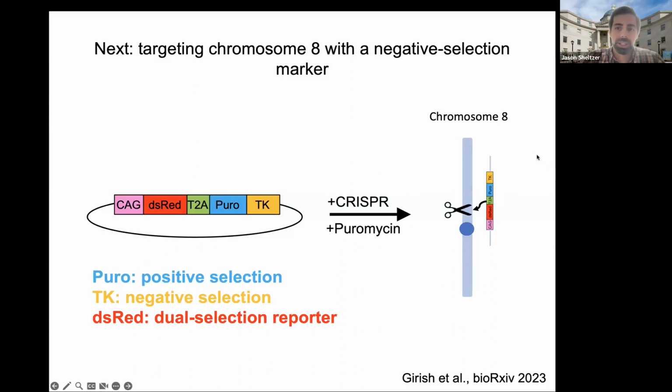However, if we're targeting, for instance, trisomy of chromosome 8, following the ganciclovir selection, the cells will lose the copy of the chromosome that has the fluorescent protein integrated. And so in the ideal situation, after our manipulations are finished, when they've lost the aneuploidy, they've lost the fluorescent protein. The cells will no longer glow red, and that won't interfere with any drug screening or any type of research that we want to do after the manipulations are done. Thank you.